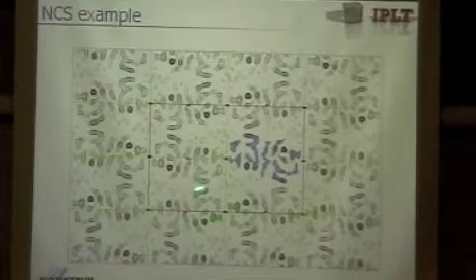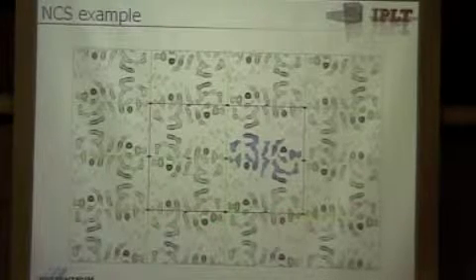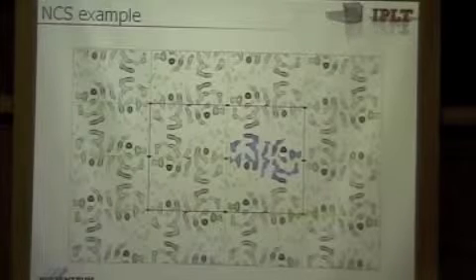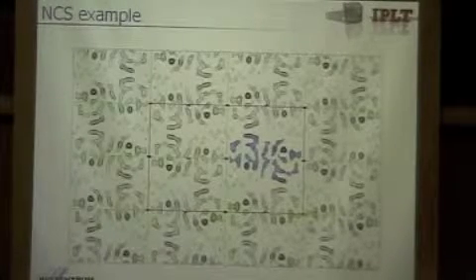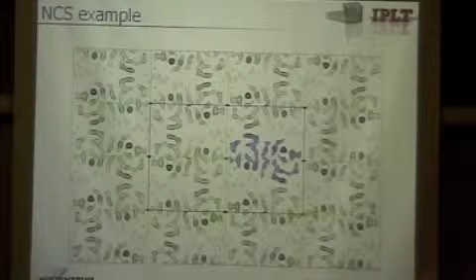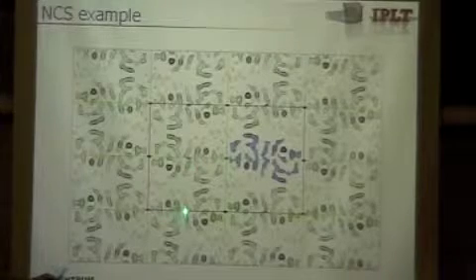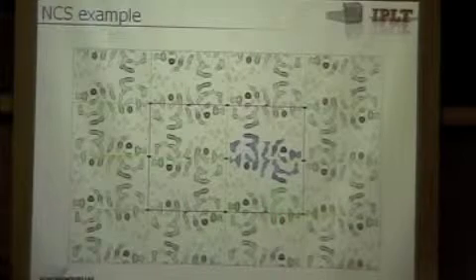But because this dimer has different inter-dimer crystallographic contacts, it makes a somewhat funny arrangement, and you see you suddenly have here an additional P2 axis of the dimer itself, which is not a crystallographic one. Huh? Isn't this P2 sub 1 2? It is already P2 sub 1 2, but this one here is still in addition. You can see it here: this is not on the axis, slightly more down, and this here is slightly more up.